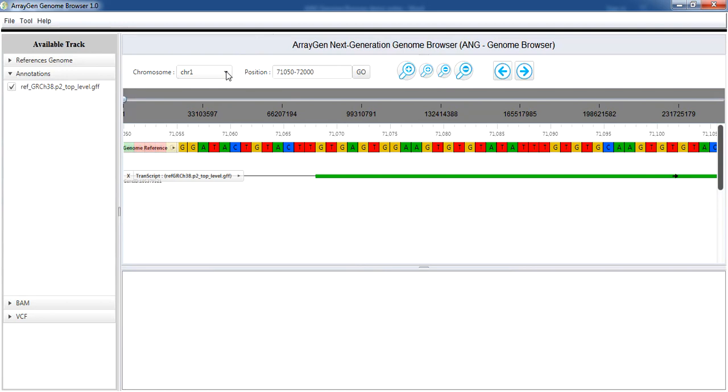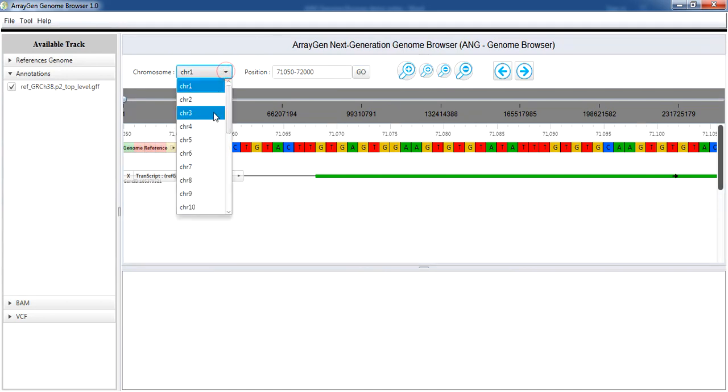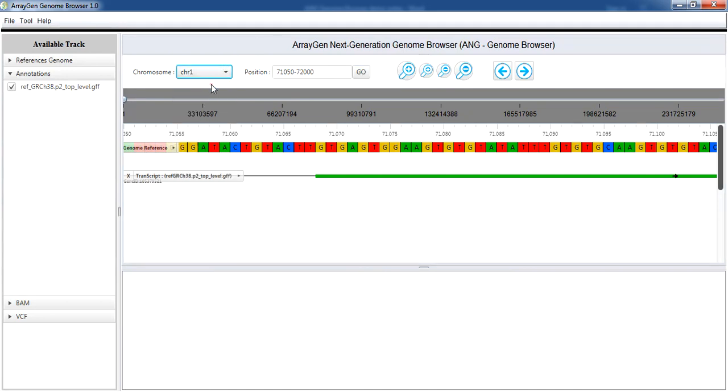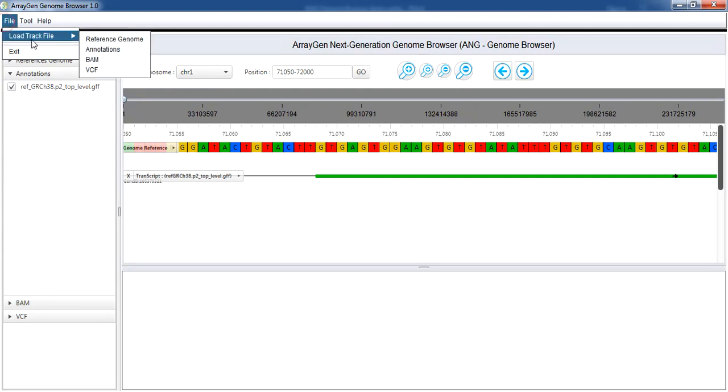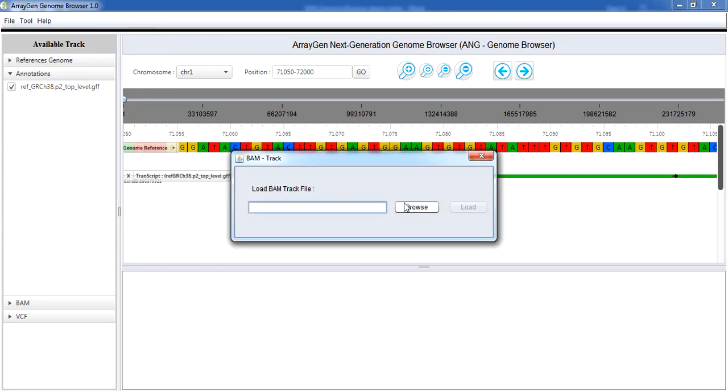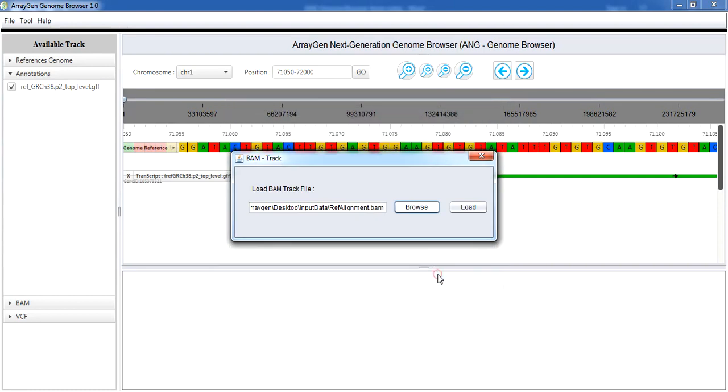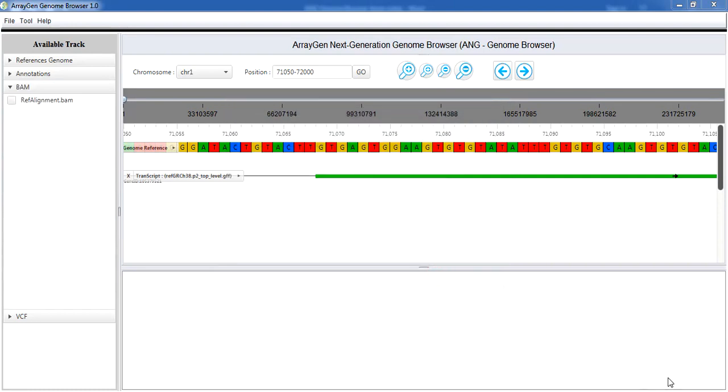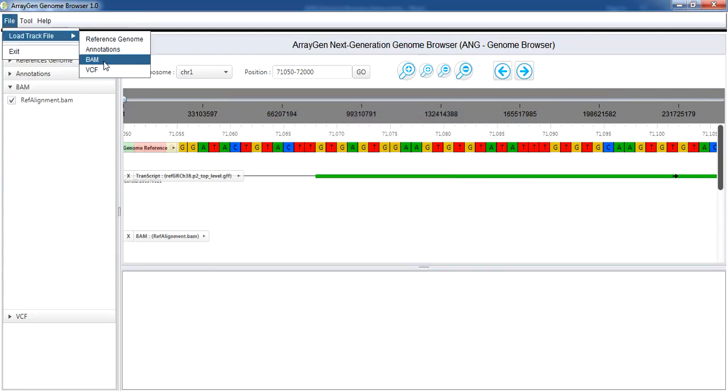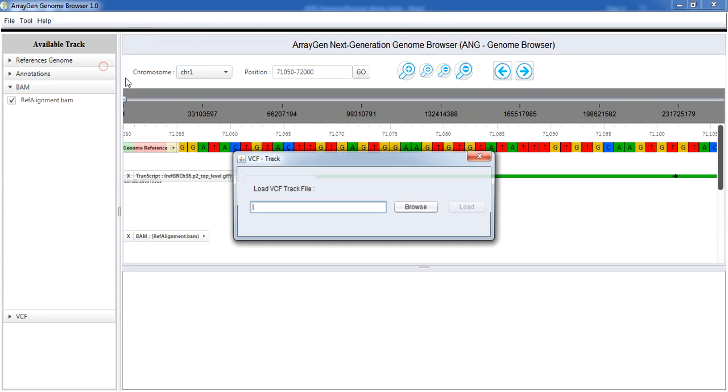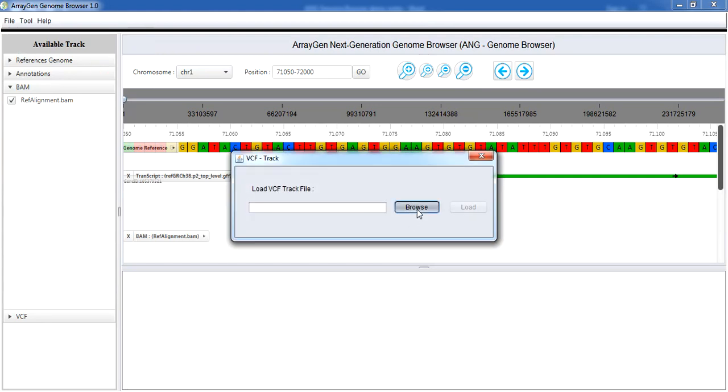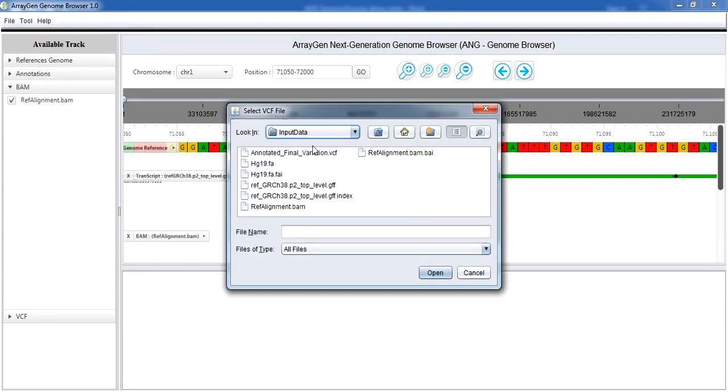Chromosome of interest is selected with chromosome drop-down list. BAM file and its VCF files derived from previous NGS analysis can be loaded for visualization. Load the BAM file and select it. Its corresponding VCF file containing the variations is loaded.